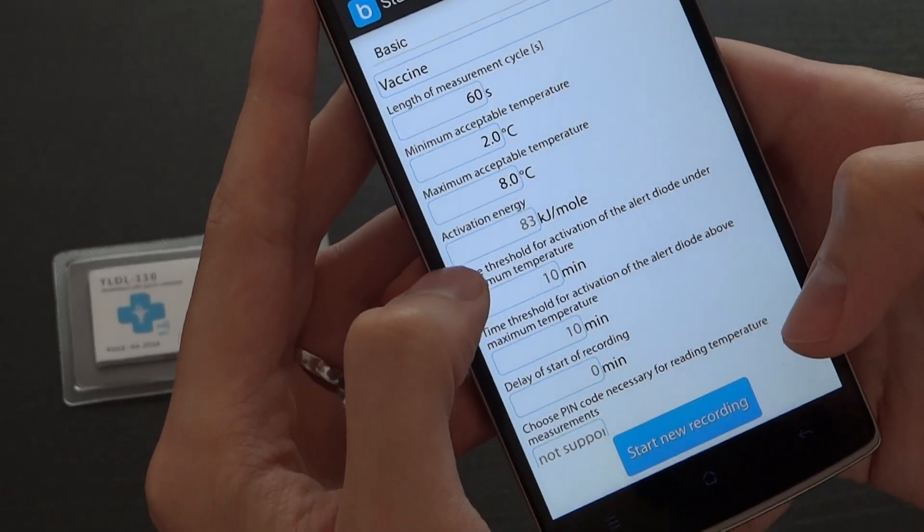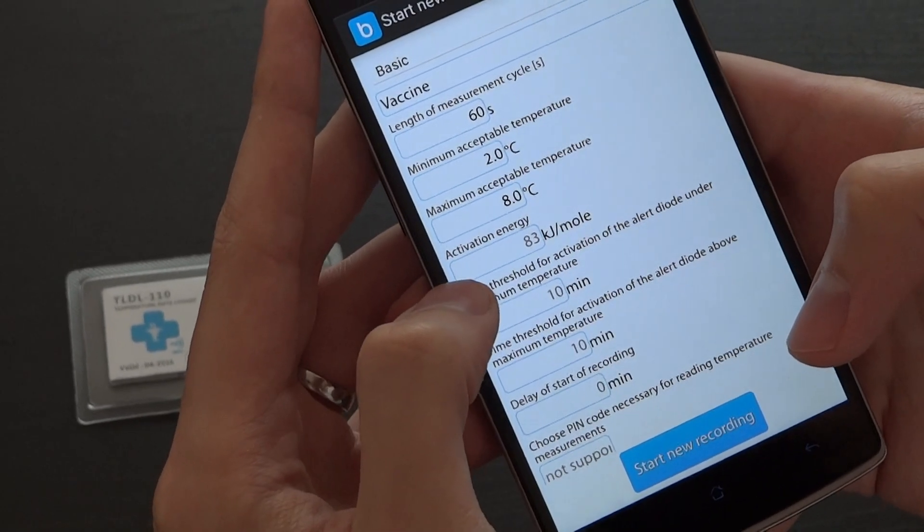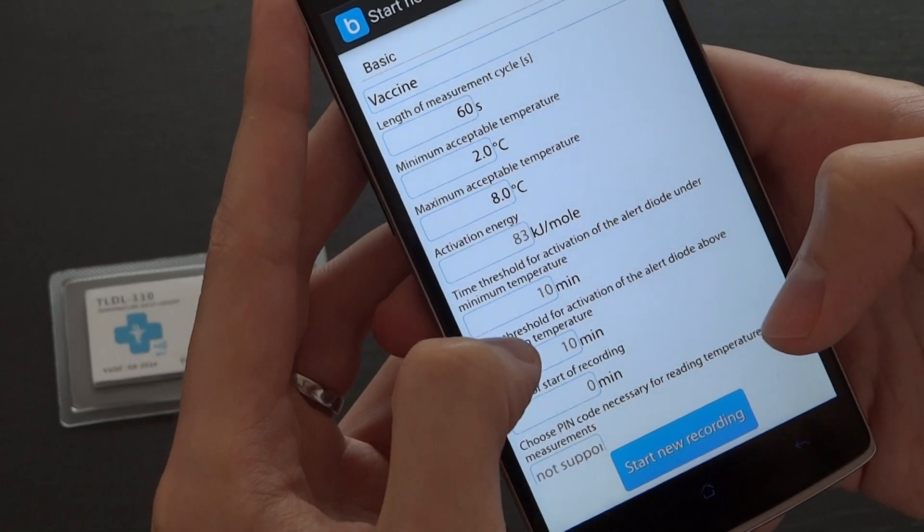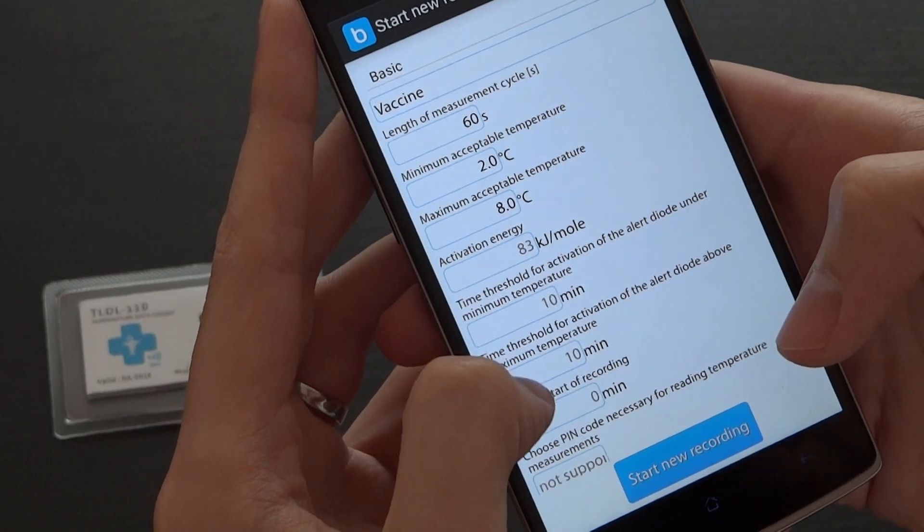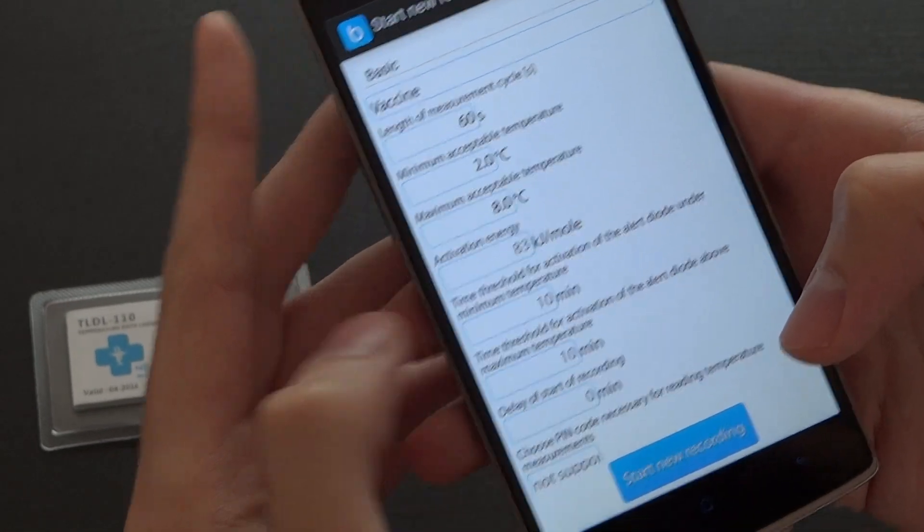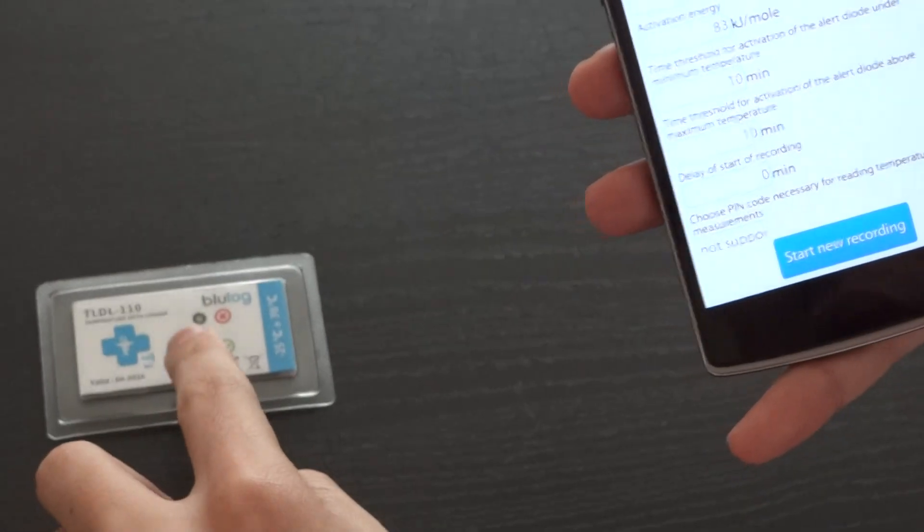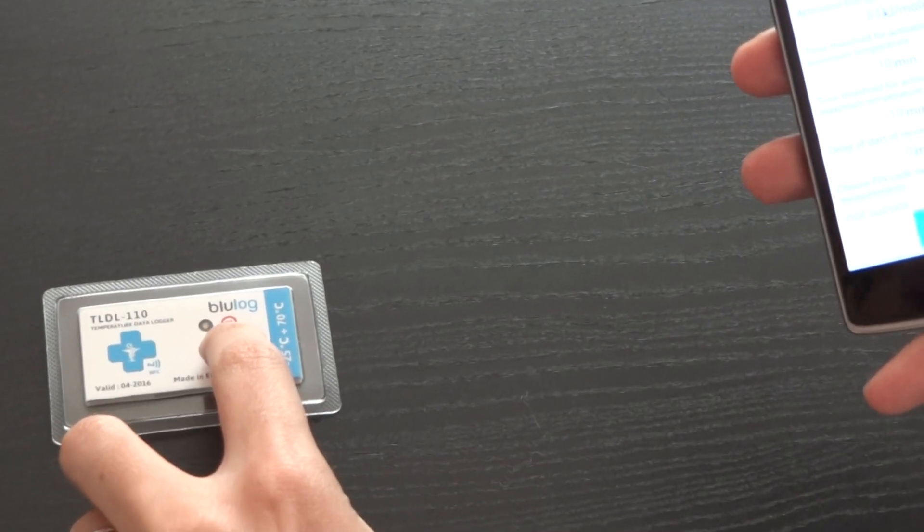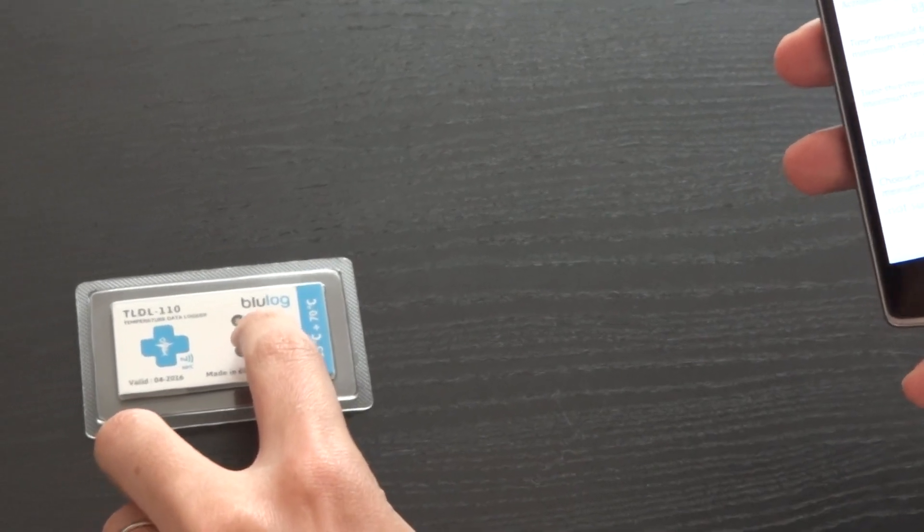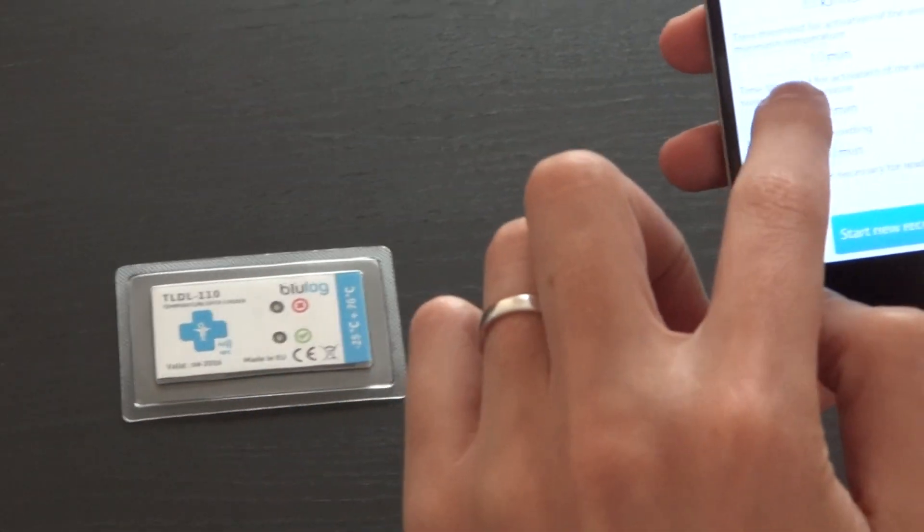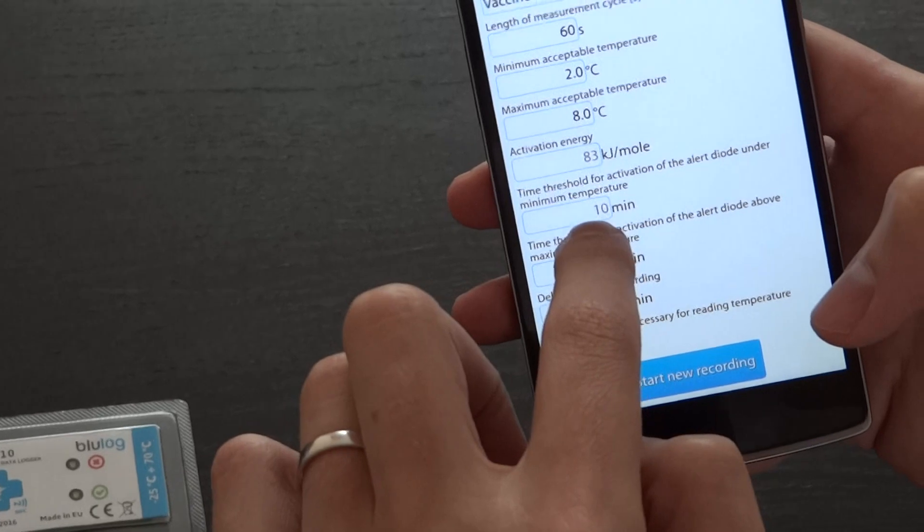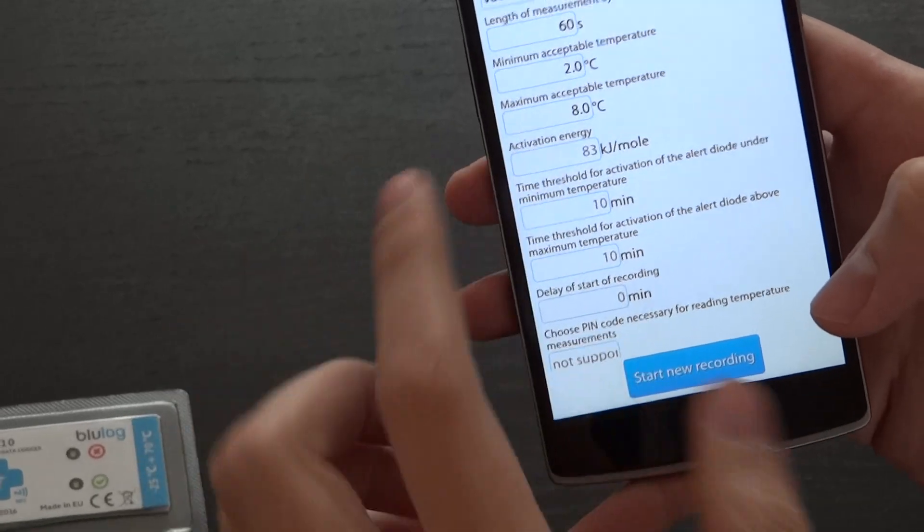Set activation energy which would be used for calculation of the mean kinetic temperature, and the time threshold for activation of the alert diodes. The red diodes would blink for instance after 10 minutes of being above 8 degrees.